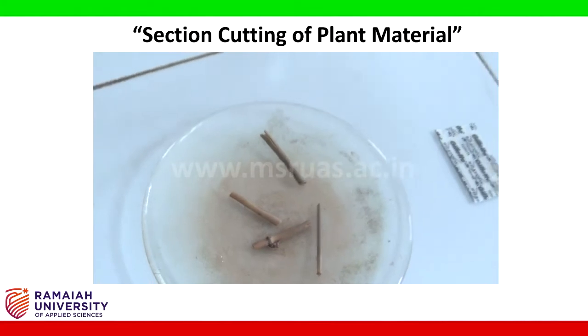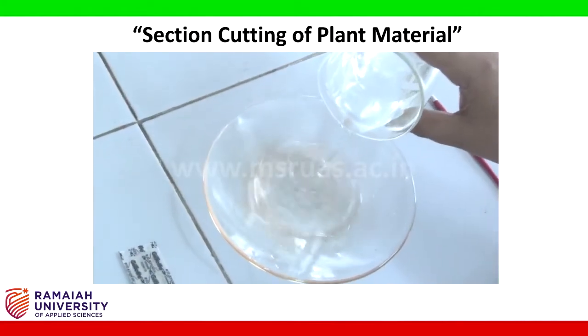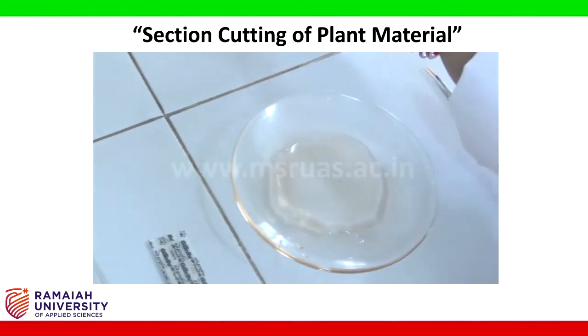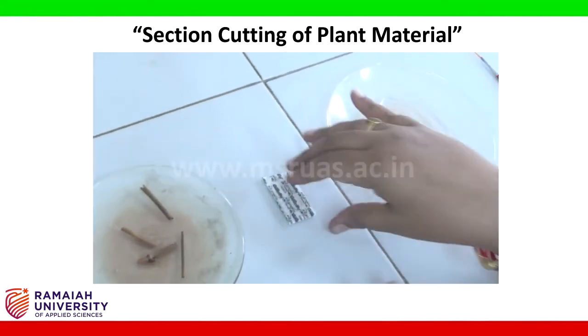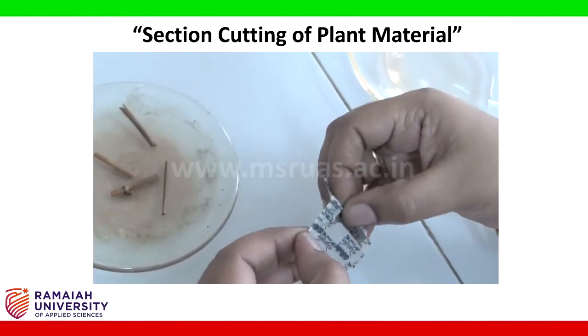And to another watch glass, add sufficient distilled water. Now open the new razor for sectioning.